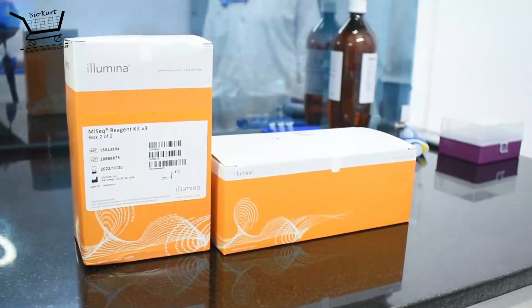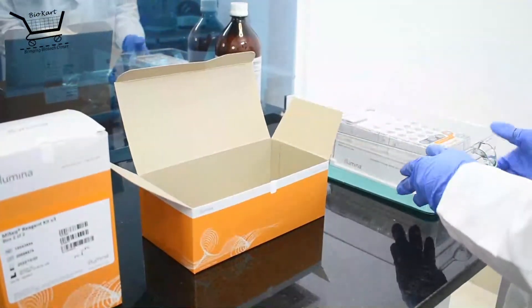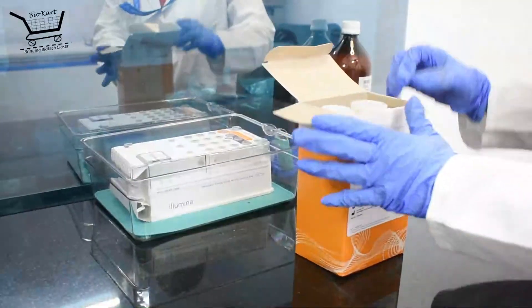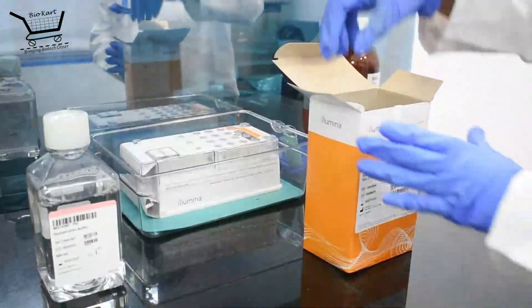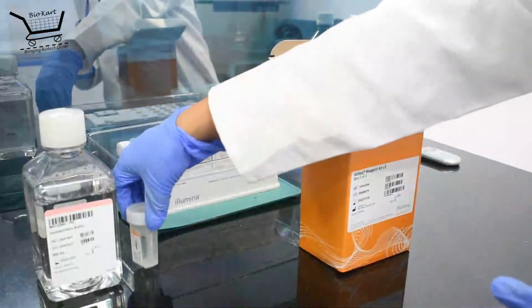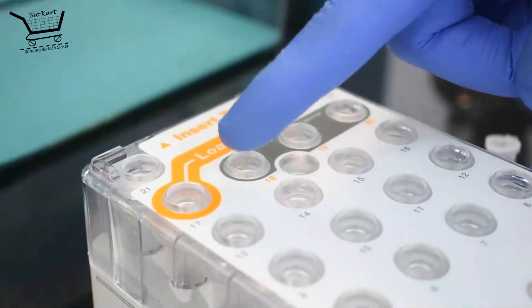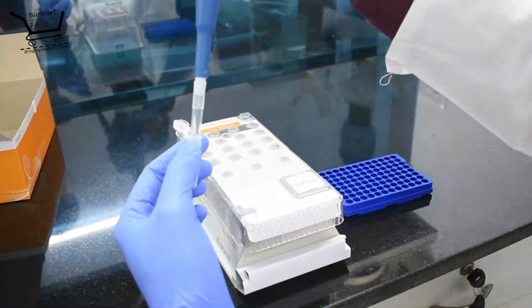The MiSeq V3-600 cycle kit and flow cell from Illumina is used. It consists of two parts. The first part contains the flow cell and the buffer which is stored at 4 degrees. The second part consists of reagents required to perform the sequencing run and stored at minus 80 degrees. The pool library is diluted to 4 nmol and the concentration is further reduced to a final loading concentration of 10 picomol. This is loaded into the designated place of the reagent kit. The kit and the flow cell are loaded into the MiSeq and the run is started.